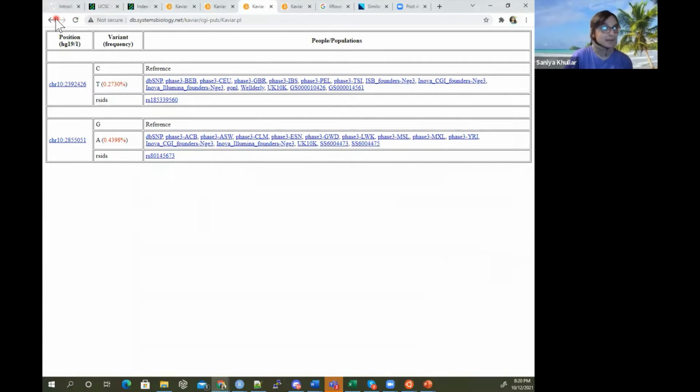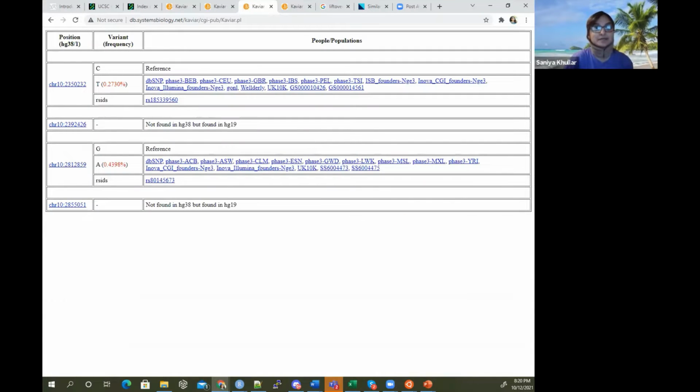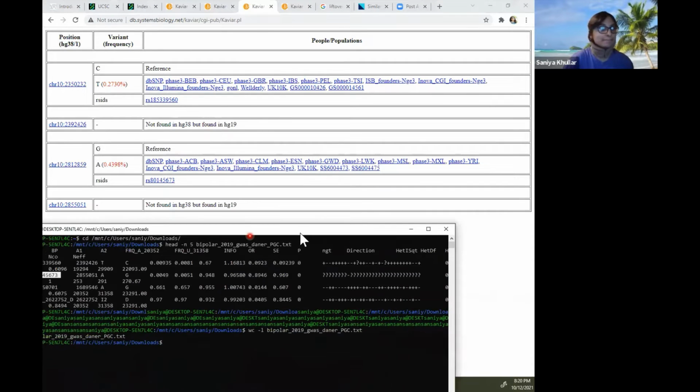I can assume that would probably be the case going on, just for those two. But why can I assume that? And why is this really huge, that it's HG19, they map properly for HG19. What we are trying out is HG19, GRCh37. I have another video where I walk through in more depth how to use this site to map genetic variants and do those conversions. So let's try it now on HG38 and see what we get. Does it all work out?